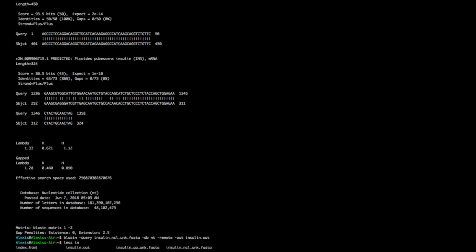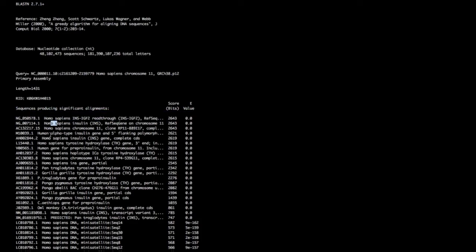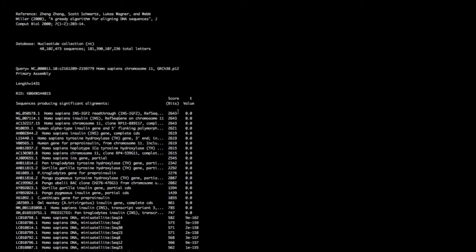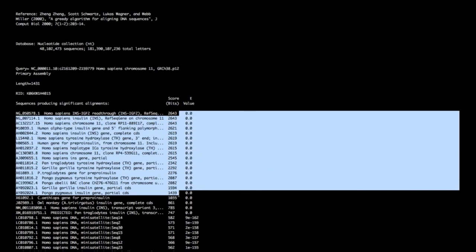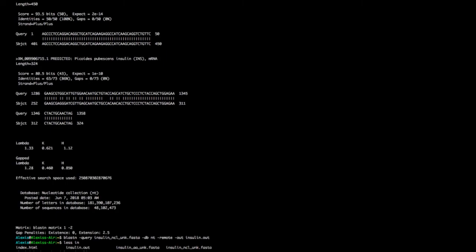If we 'less' the insulin output file, we see that our first match is Homo sapiens — and it remains Homo sapiens for many hits. It's almost a perfect match with an E-value estimated at zero, which doesn't mean it's bad — it's so small it rounds to zero. The best match by score is Homo sapiens, so our insulin nucleotide unknown sequence is probably from humans.